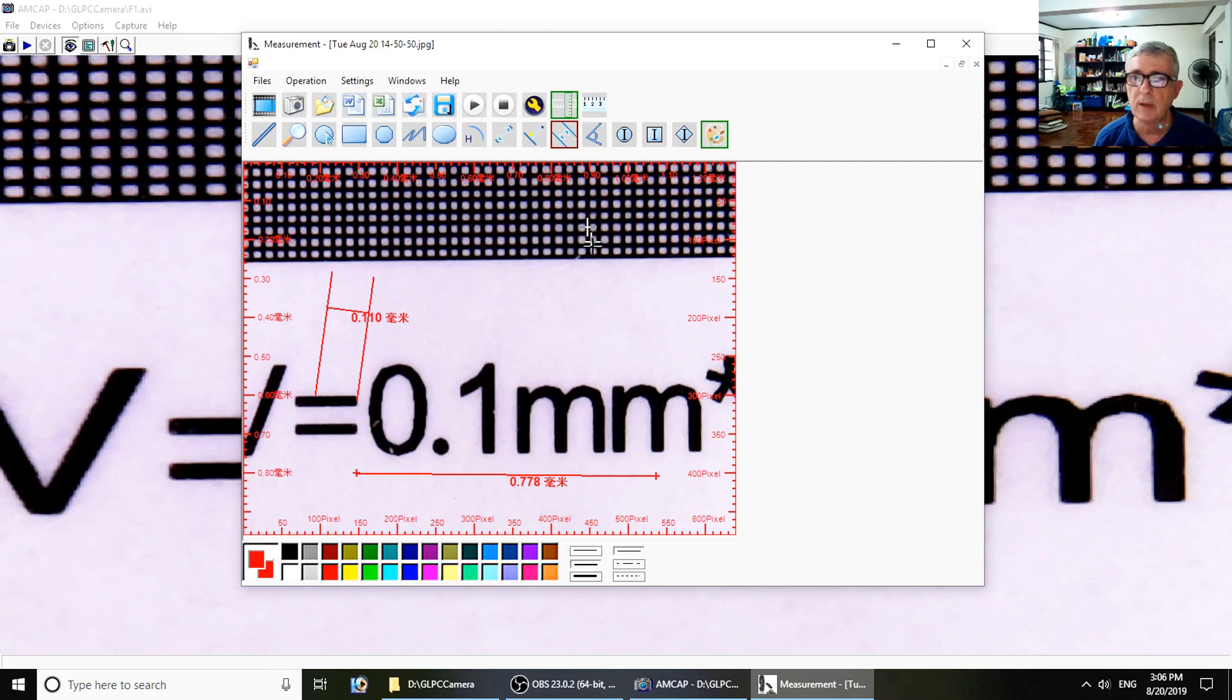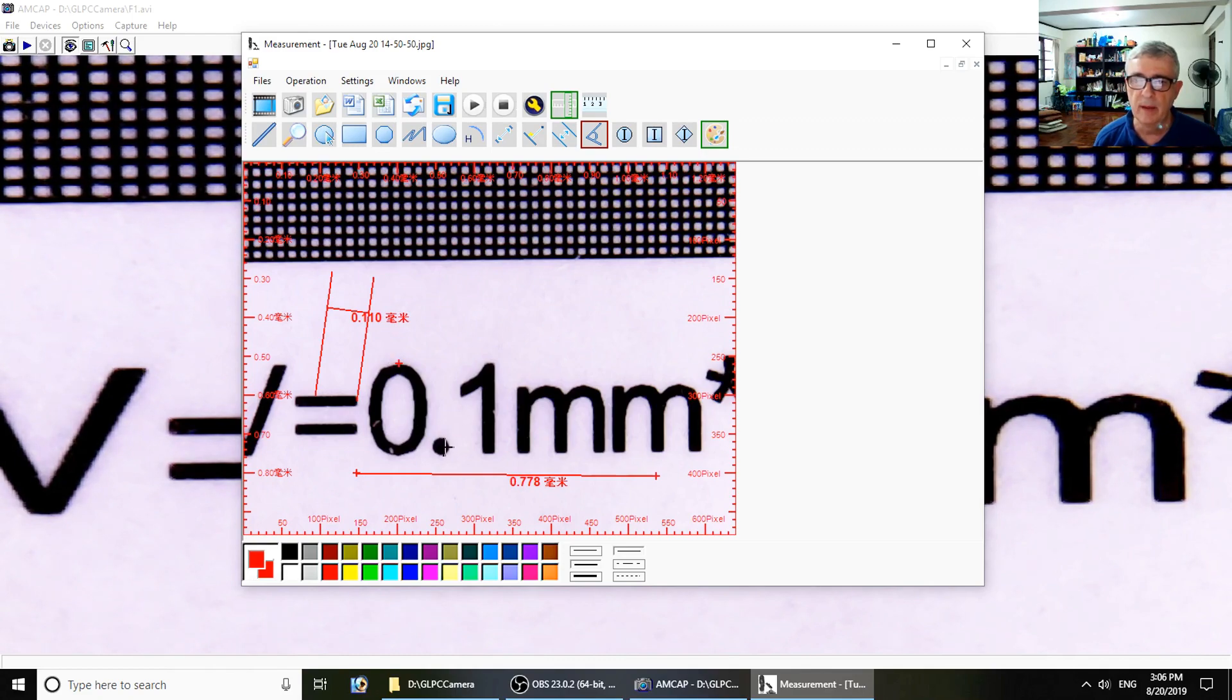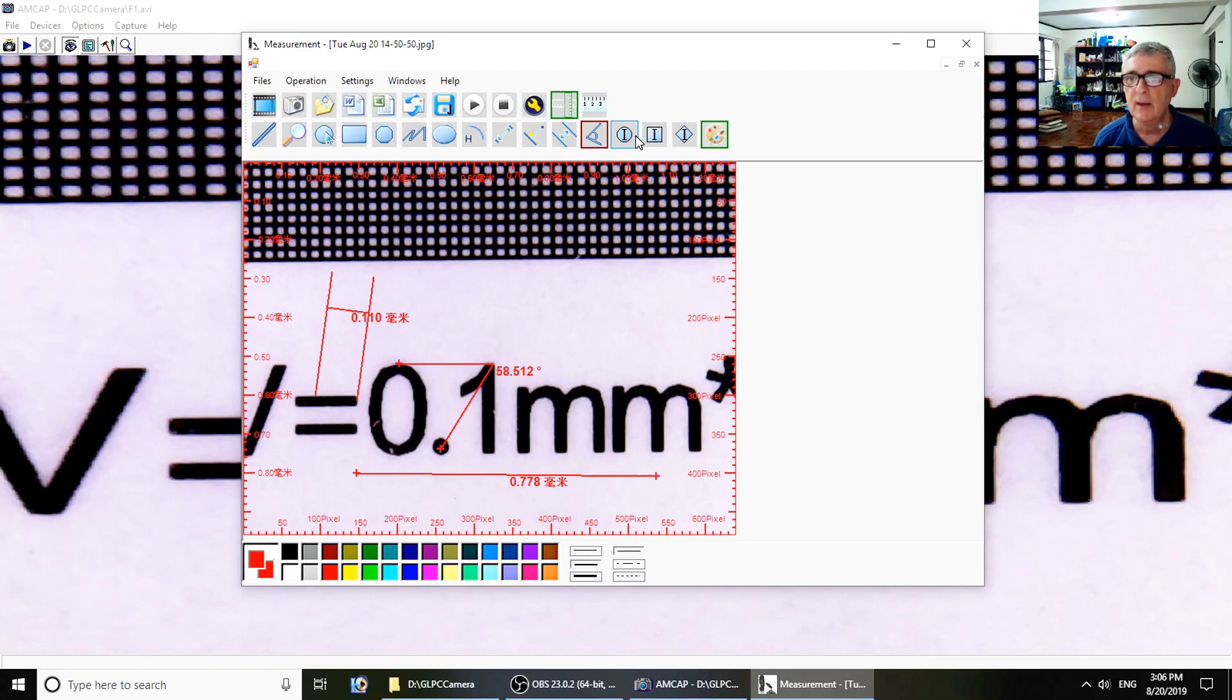This is my favorite one - angle. You can get the angle between, I don't know, say the top of this dot and the top of the one, so that angle is 58.512 degrees.